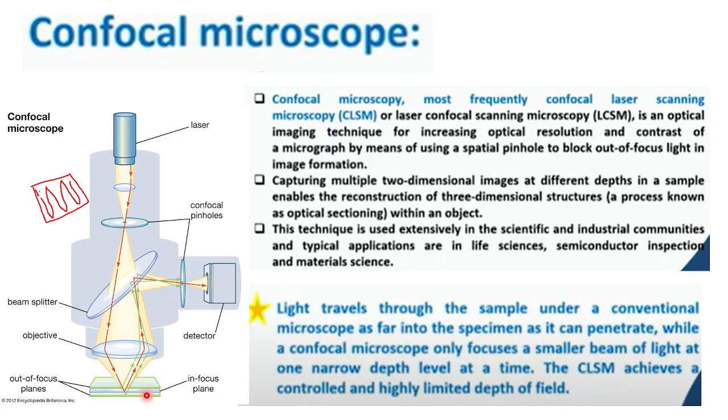Actually, you need to do that either manually, as I have already told you, or through software. For example, if you have a 10 millimeter thick sample, first take the data from the surface, after that cut 1 millimeter and get the data from below the surface.